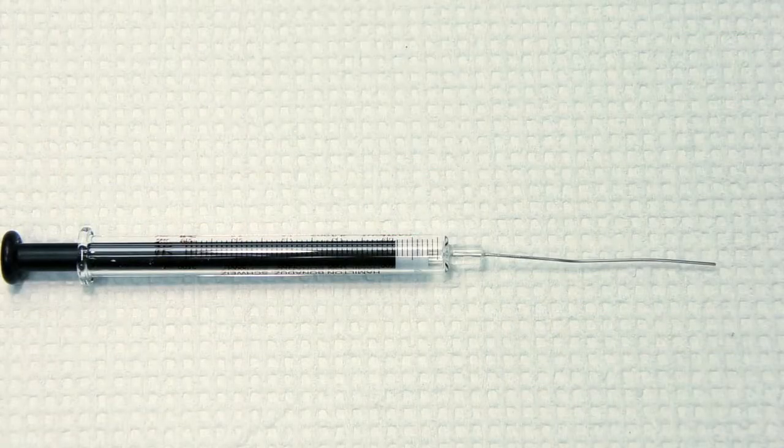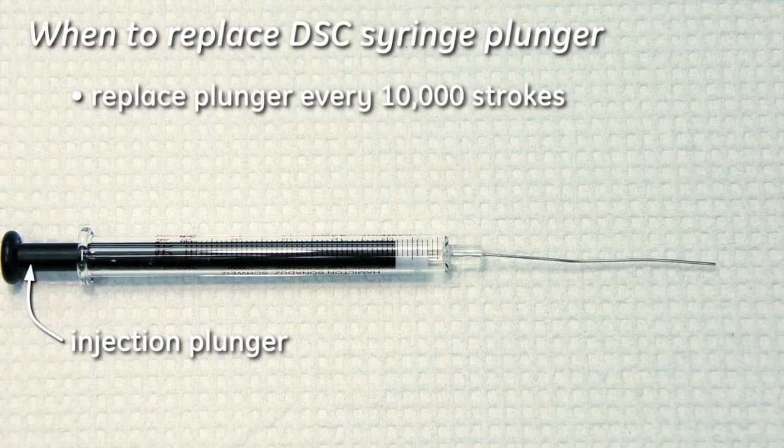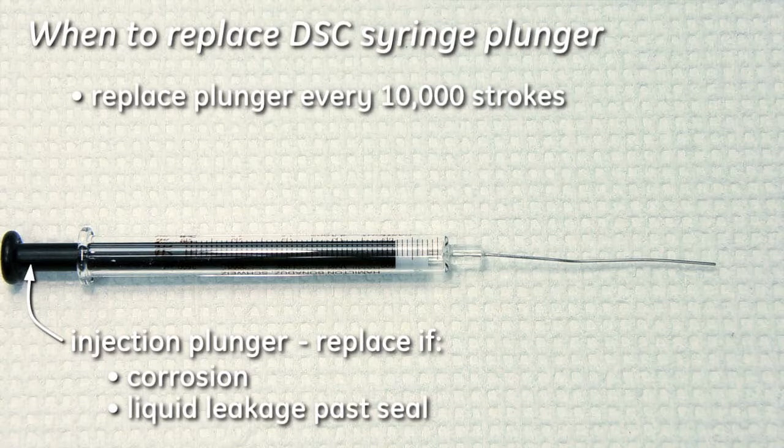The DSC syringe plunger should be replaced at least every 10,000 strokes. You also want to replace the injection plunger if you see obvious corrosion around the lower black area or the lower white area of the piston, or if you see leakage between the plunger and the glass.